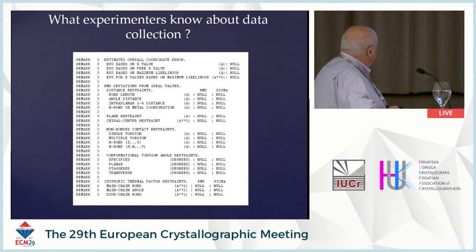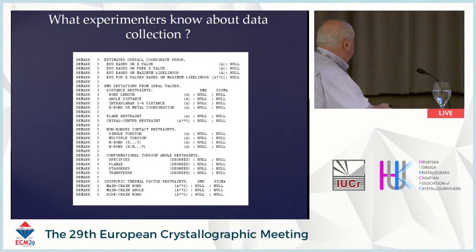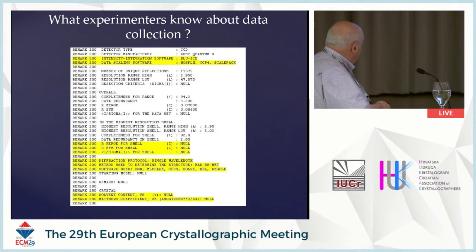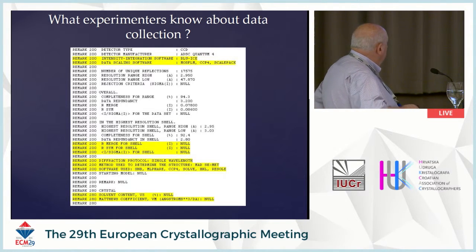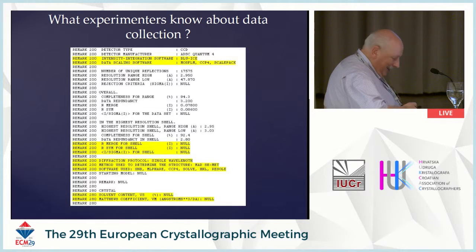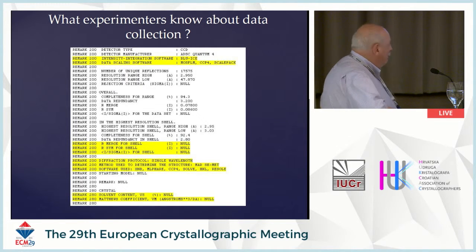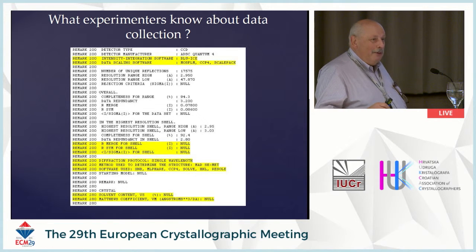The real question is: what does the experimenter know about data collection? As you see, very little. This is a real deposit from the PDB. Or you may have some numbers full of wrong information, because Blu-Ice cannot integrate data. R-merge — because of that we do not have R-merge, I may say. It was a single wavelength experiment, but it was multi-wavelength anomalous diffraction. The solvent content, obviously, was not known, despite the fact that we can easily recalculate it.